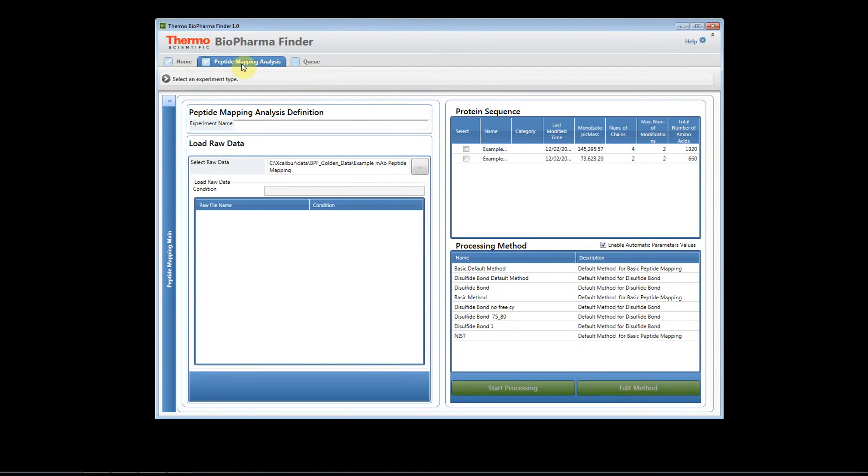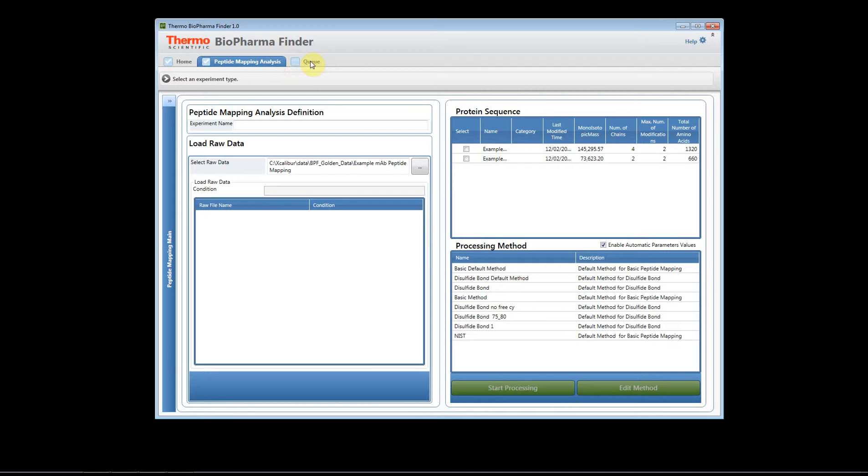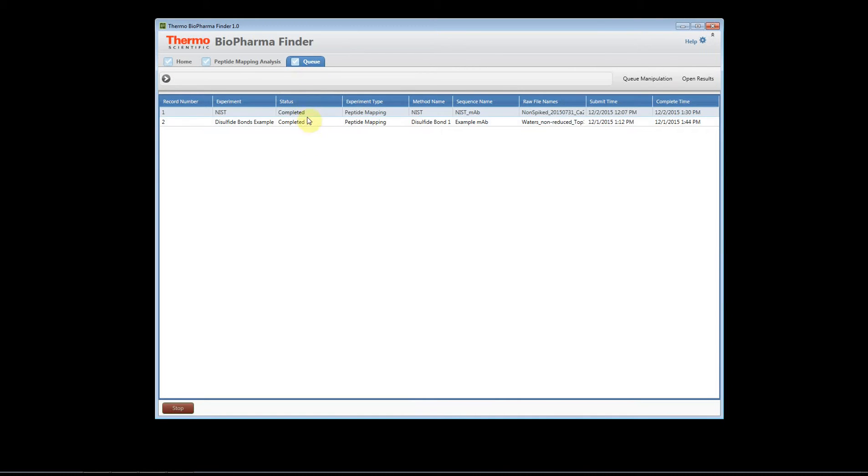You'll notice that a new tab appears at the top of the software. This is our peptide analysis tab and you can also go to the queue where you could look at previous experiments that you might have already run.